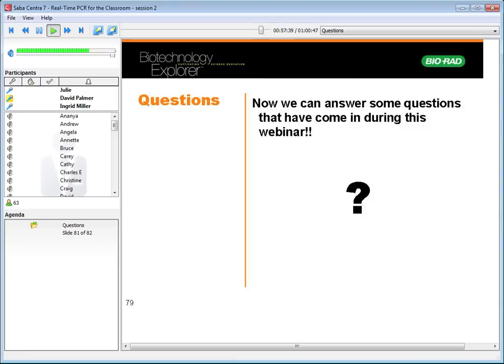Oh, yeah, I like this question. How much background do the students need? From someone who currently teaches 9th graders. I have actually taught in one of my PCR classes continuing ed students, one of which had very little background, definitely no college background, and I don't think, if I remember right, he had finished high school. By the end of it, he was actually very comfortable with how DNA structure was, how regular PCR worked, and how real-time PCR worked. So even though a class may not understand all the concepts or all the levels, I think a lot of these things are applicable to a wide range. And because real-time PCR touches on so many different things, the structure of DNA, how to draw graphs, how to analyze graphs, how to design experiments, how chemistry works, I think it can be used in a lot of different situations.